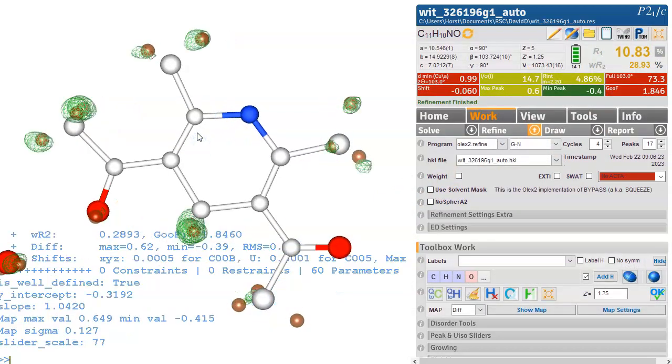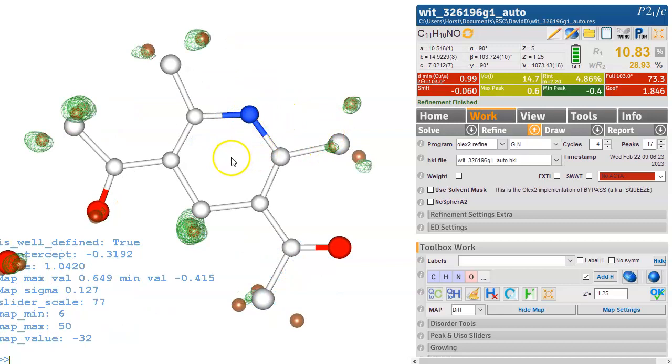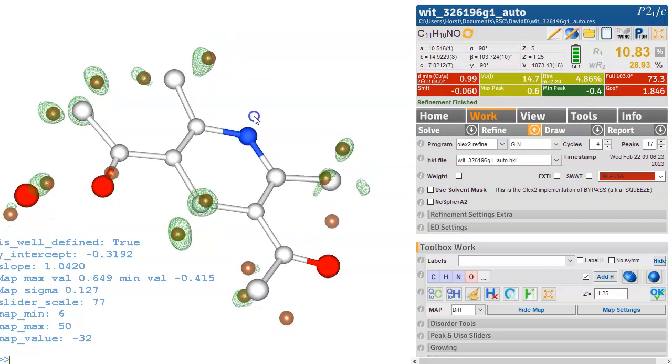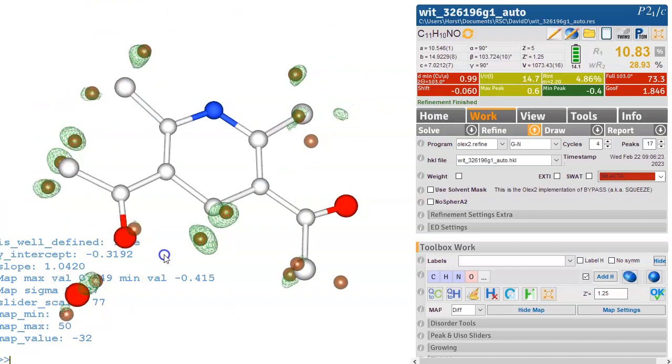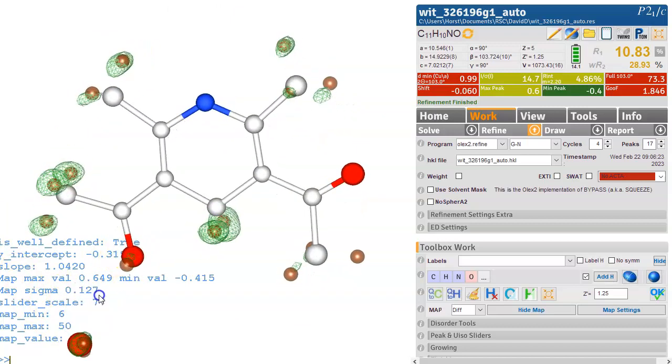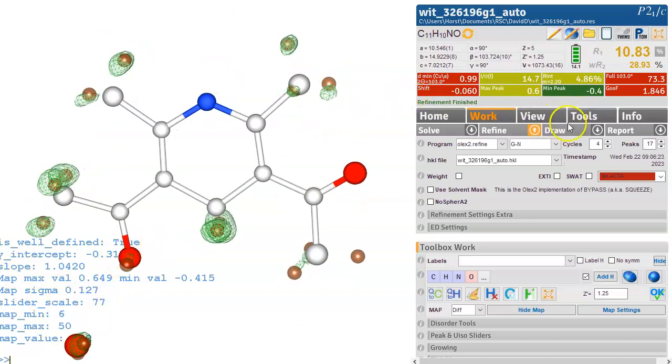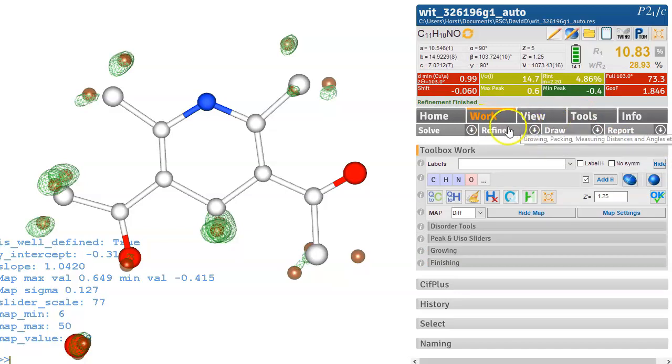And we can press Ctrl M at any point that should give us the residual density map and then we can already quite clearly see there are some hydrogen atoms here that clearly are missing. This is going to be a water molecule. So how do you proceed? Well normally I would suggest you head over to the refinement stuff we just leave it white switch a CIF file on so we always get a CIF file coming through and we can hide this for now we click on this here.